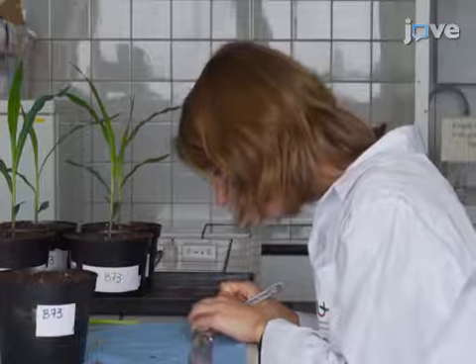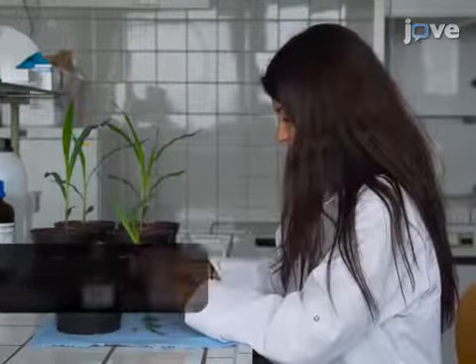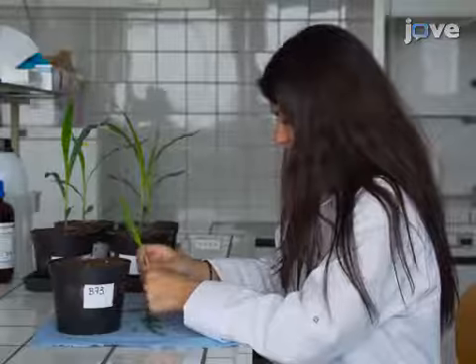Visual demonstration of these methods is critical, as the harvesting, sample preparation and measurement steps are difficult to perform without a demonstration. Demonstrating the procedure will be Katrien Sprangers and Viktoriya Avramova, two PhD students from my laboratory.